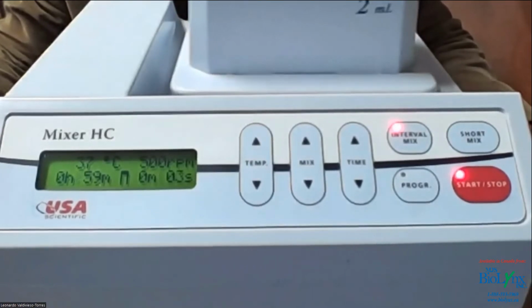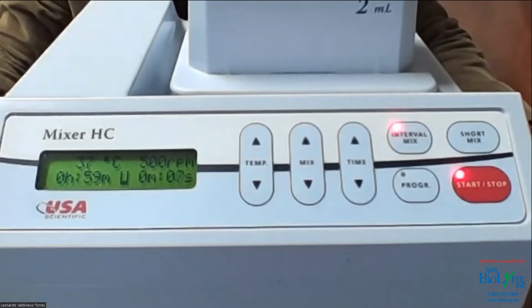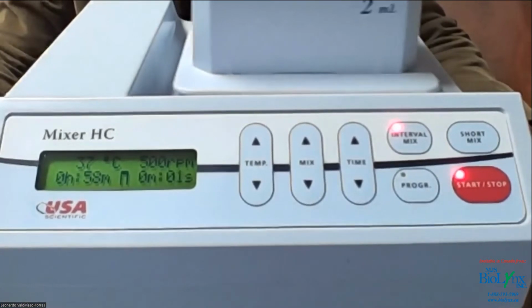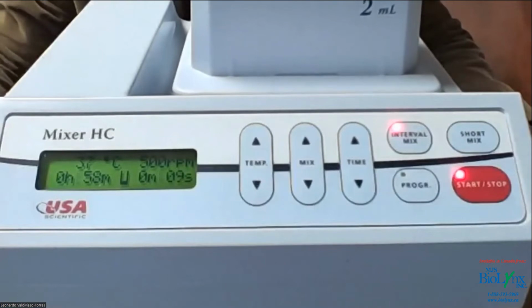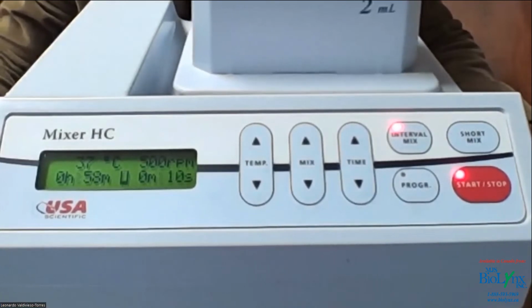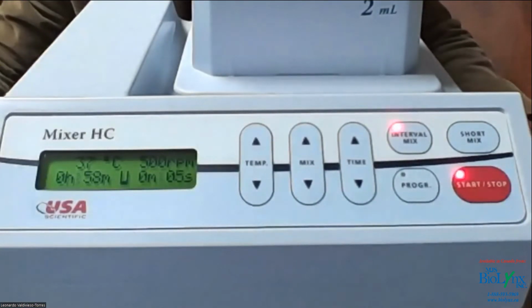I see 4 chats. Yeah, there's one question that Garrett kind of answered, but how does the mixing speed compare to the Vortex mixer? Just if you could elaborate on that. Well, it depends on the block, right? And the Vortex usually is for very harsh mixing, like when you want to break something. That's when you usually use the Vortex. But I think it's pretty comparable, depending on what speed you use in the Vortex, because you can also adjust the Vortex speed.